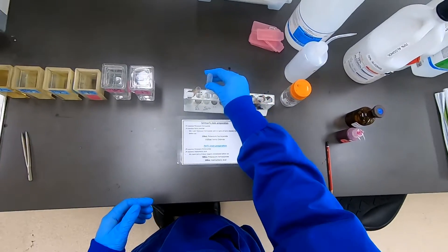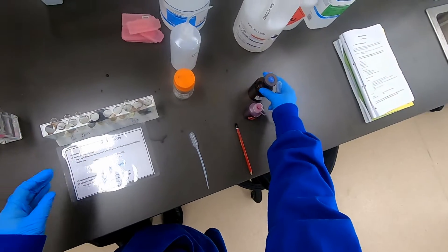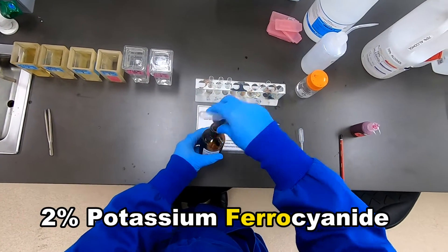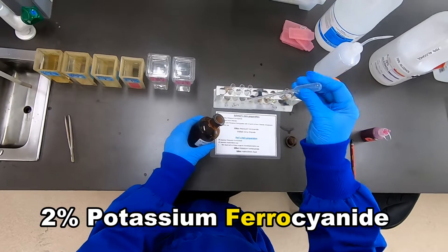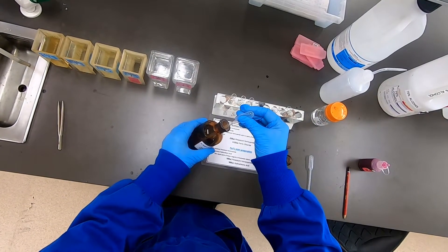The next reagent is the potassium ferrocyanide. It's important to always check that you have the correct reagent so as not to confuse it with potassium ferricyanide used in the Schmoll's stain.